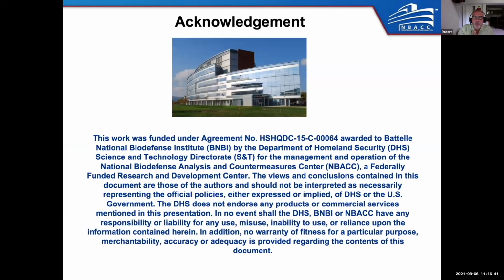Okay, so this is the building I work in. It's a national laboratory for the Department of Homeland Security. And we have biological safety level laboratories at biological safety level 2, 3, and 4. So you see all those guys in those blue suits or white suits. Well, we do actually wear those, and we do process EM samples at BSL 2, 3, and 4.